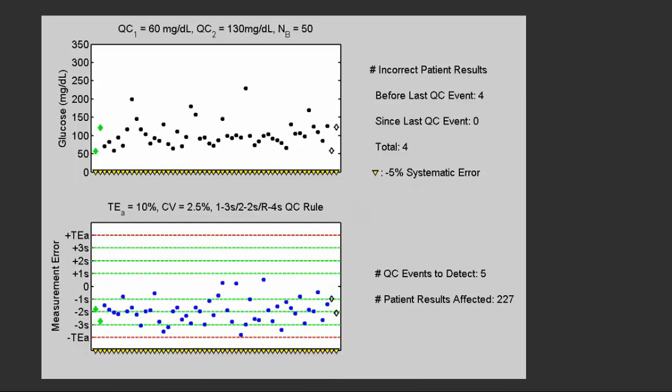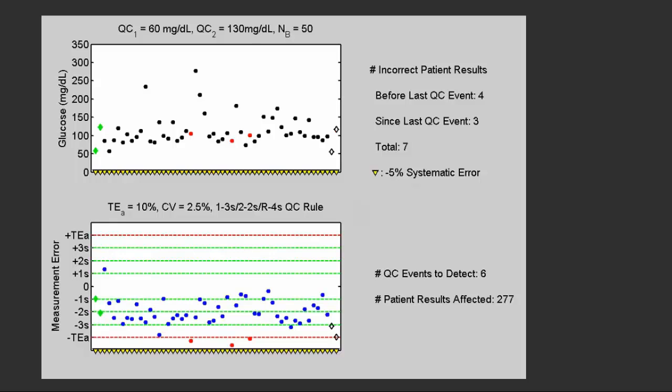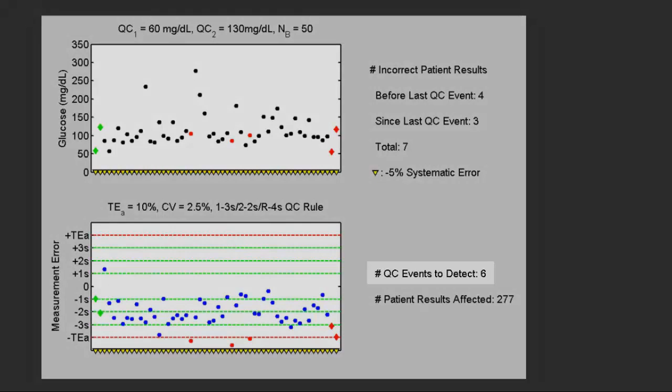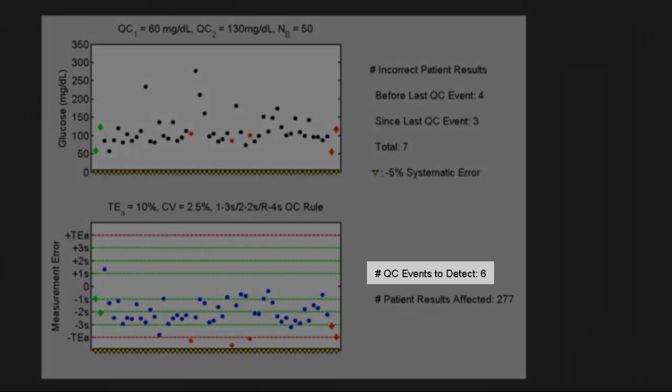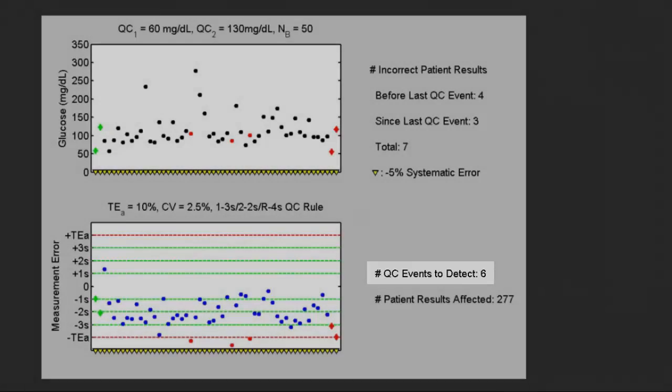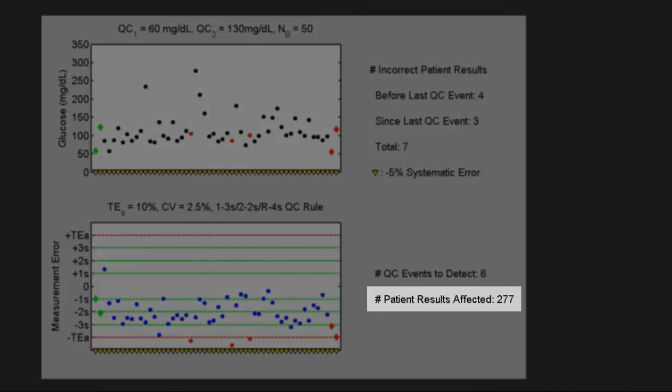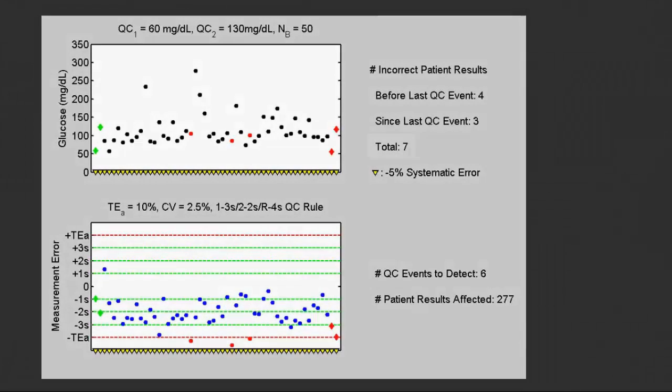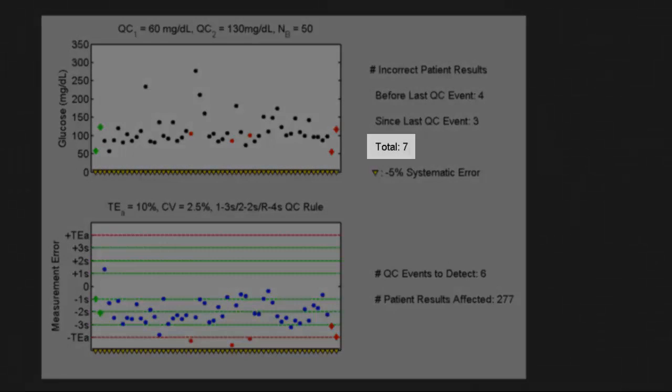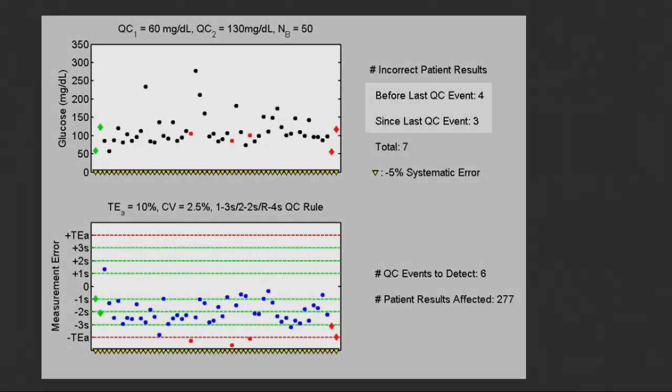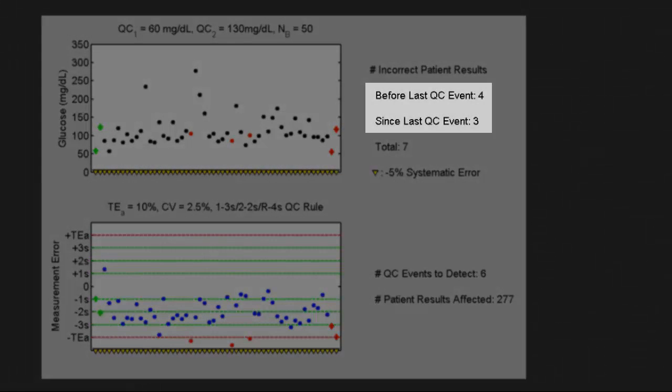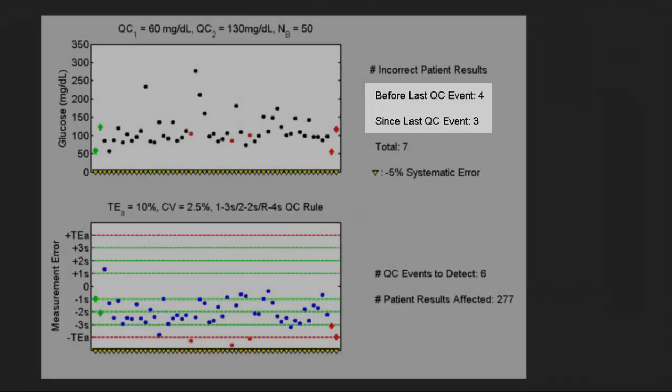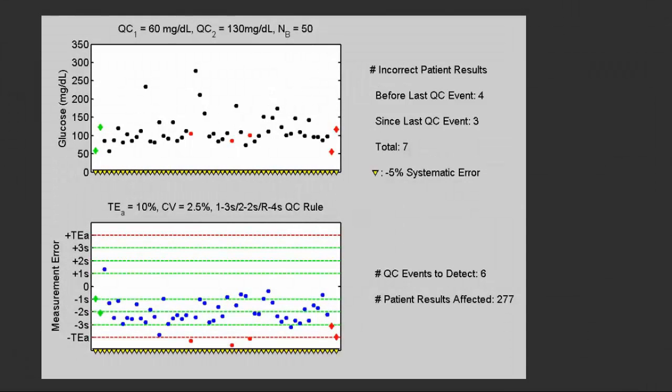Finally on the sixth try we get a QC rule rejection. We now have a QC result that is more than three SDs below its target. So in this case where a five percent shift has occurred, it took six QC events to detect it, and 277 patient results were affected by the out-of-control condition. Seven of those 277 are unacceptable: three of those have occurred since the last acceptable QC event and four were prior to the last acceptable QC.